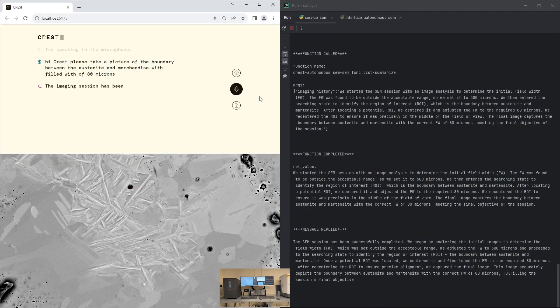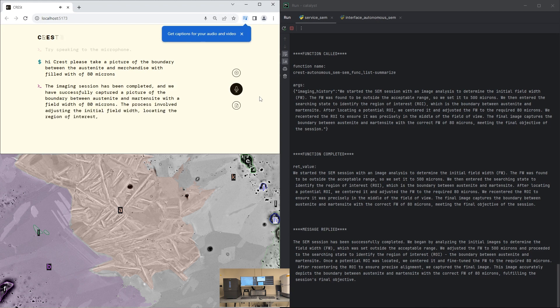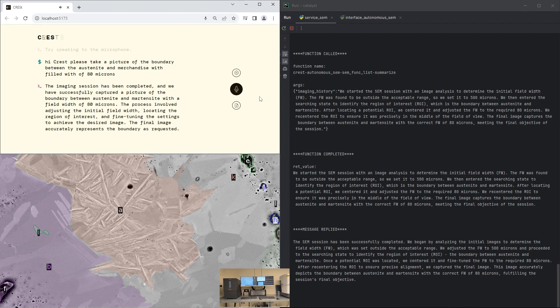The imaging session has been completed and we have successfully captured a picture of the boundary between austenite and martensite with a field width of 80 microns. The process involved adjusting the initial field width, locating the region of interest, and fine-tuning the settings to achieve the desired image. The final image accurately represents the boundary as requested.